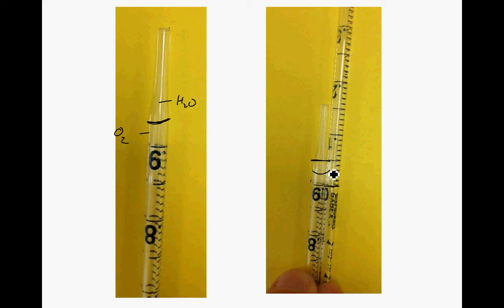So this would be 0.91, 0.92, 0.93. Right? So I'd read that as 0.93 as my starting spot. So if that's the case, then that's what you're going to have to do. But you need to get this initial volume in there.